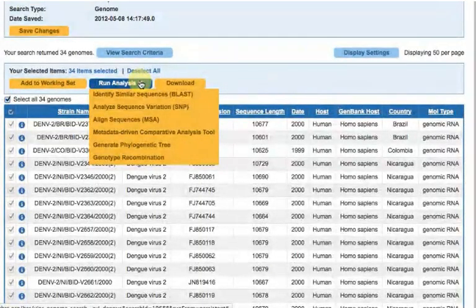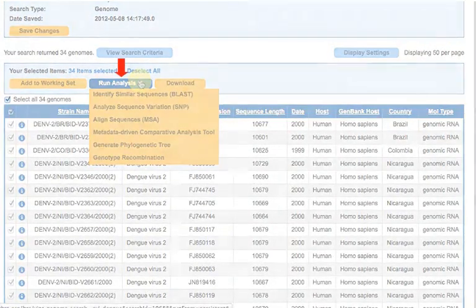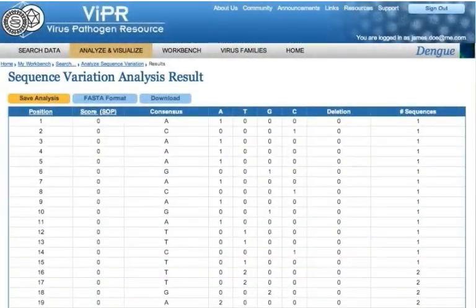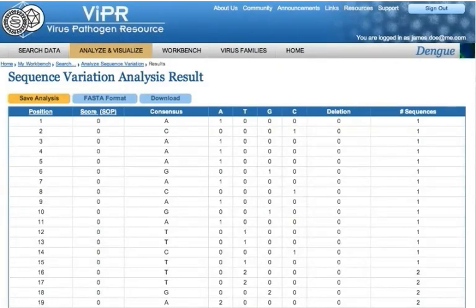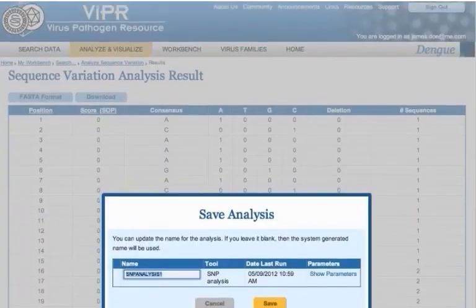Mouse over the Run Analysis button and select an analysis. If the analysis completes quickly, it will display on the page as soon as it finishes. You can click the Save Analysis button to save the results to your workbench.